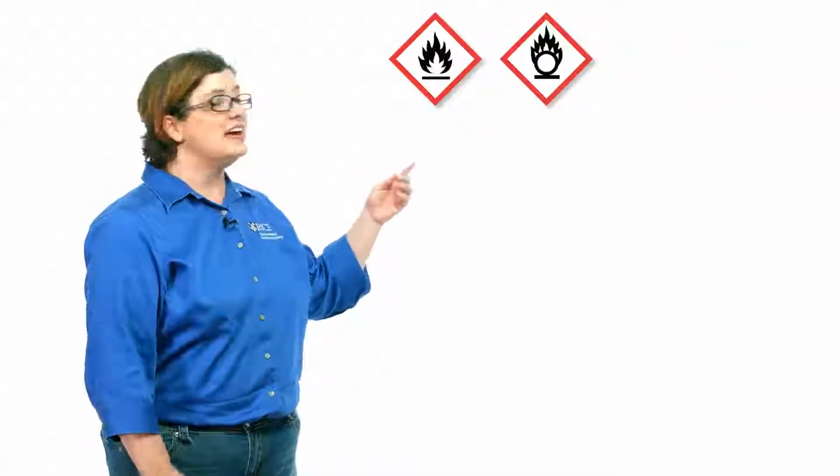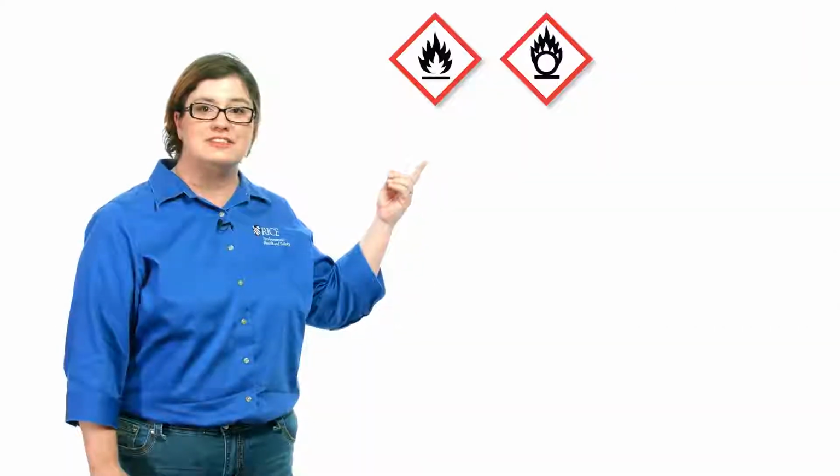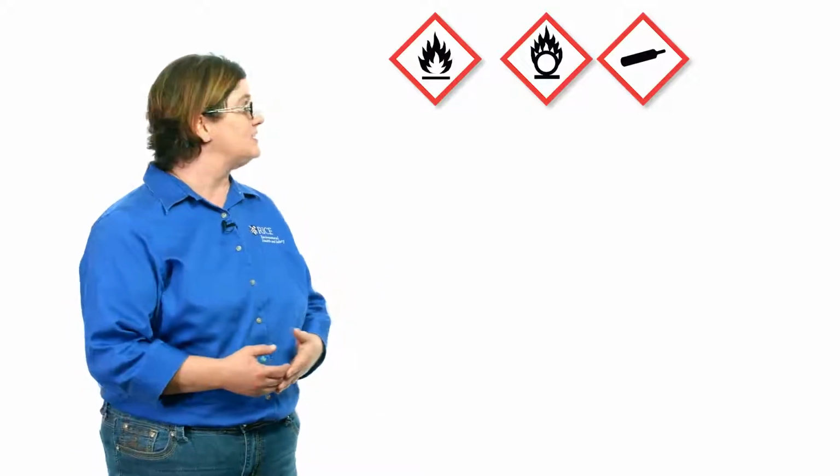They include identification of the hazards. They also include first aid measures, in addition to firefighting measures for each of the materials in the laboratory. The flame represents the flammables, and then we have the symbol for oxidizers. The gas cylinder represents gases under pressure. The skull and crossbones represents acute toxins.